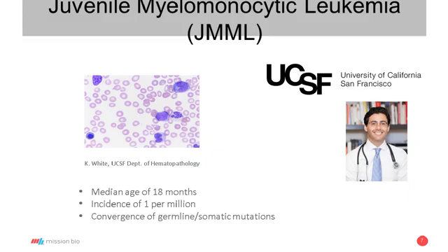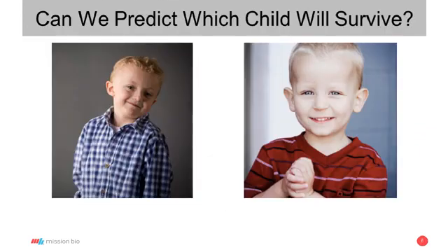It's a really good model organism to study leukemia, and that's why it's been used quite often to study the basis of disease formation. And when Dr. Stieglitz was in our offices, the challenge that he put in front of us was: could we tell the difference between these two children that were enrolled in a clinical trial, both of them with this form of rare leukemia?